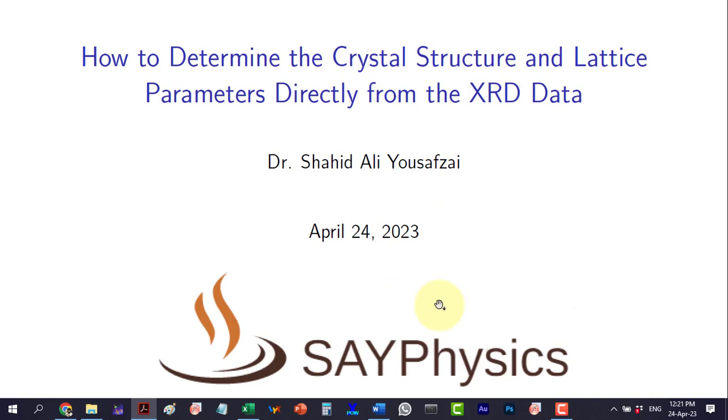It is my sincere expectation that this tutorial has provided you with the necessary guidance to accurately ascertain the crystal structure, Miller indices and lattice constant from XRD data. Once the structure has been determined, the bond angles can be readily deduced.